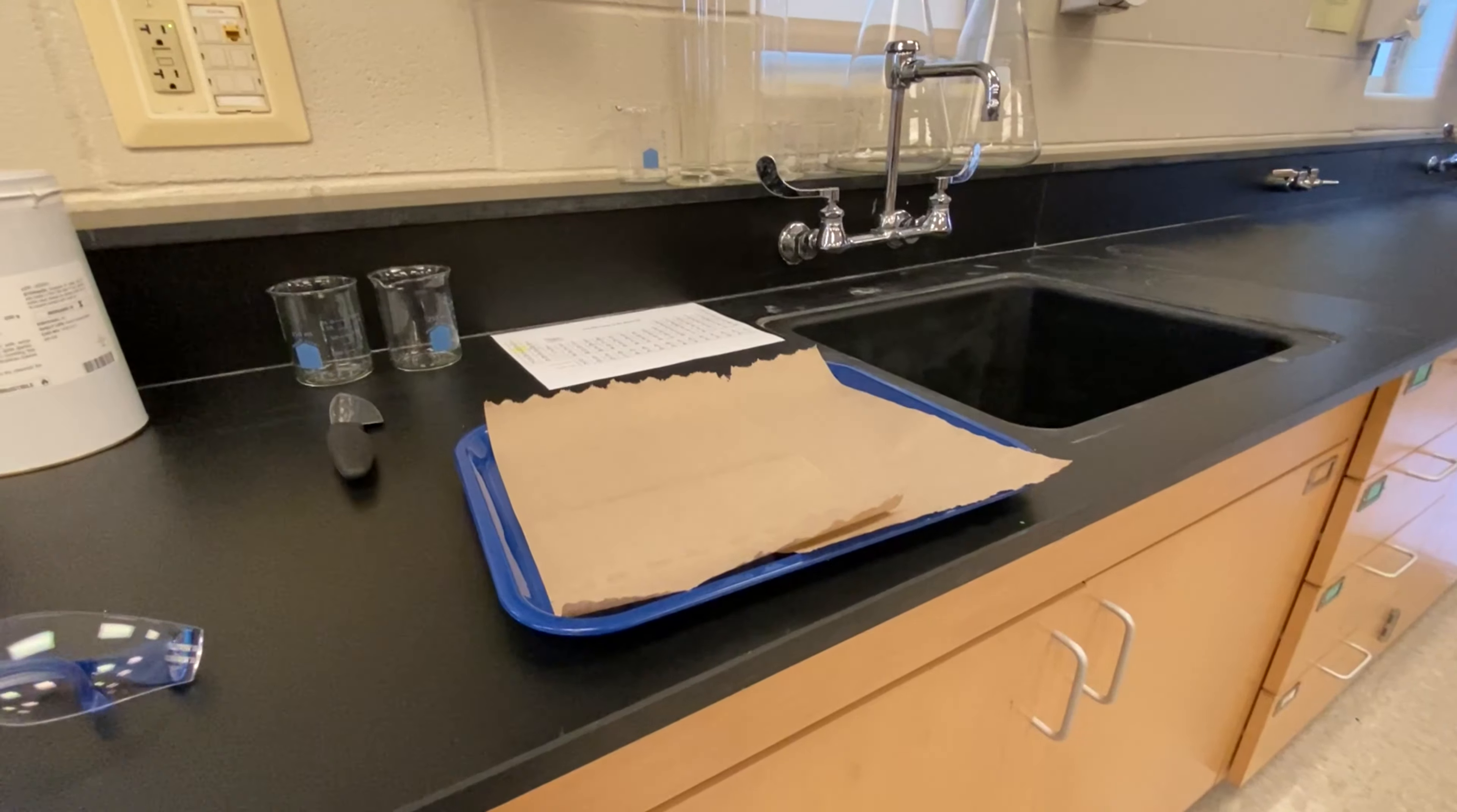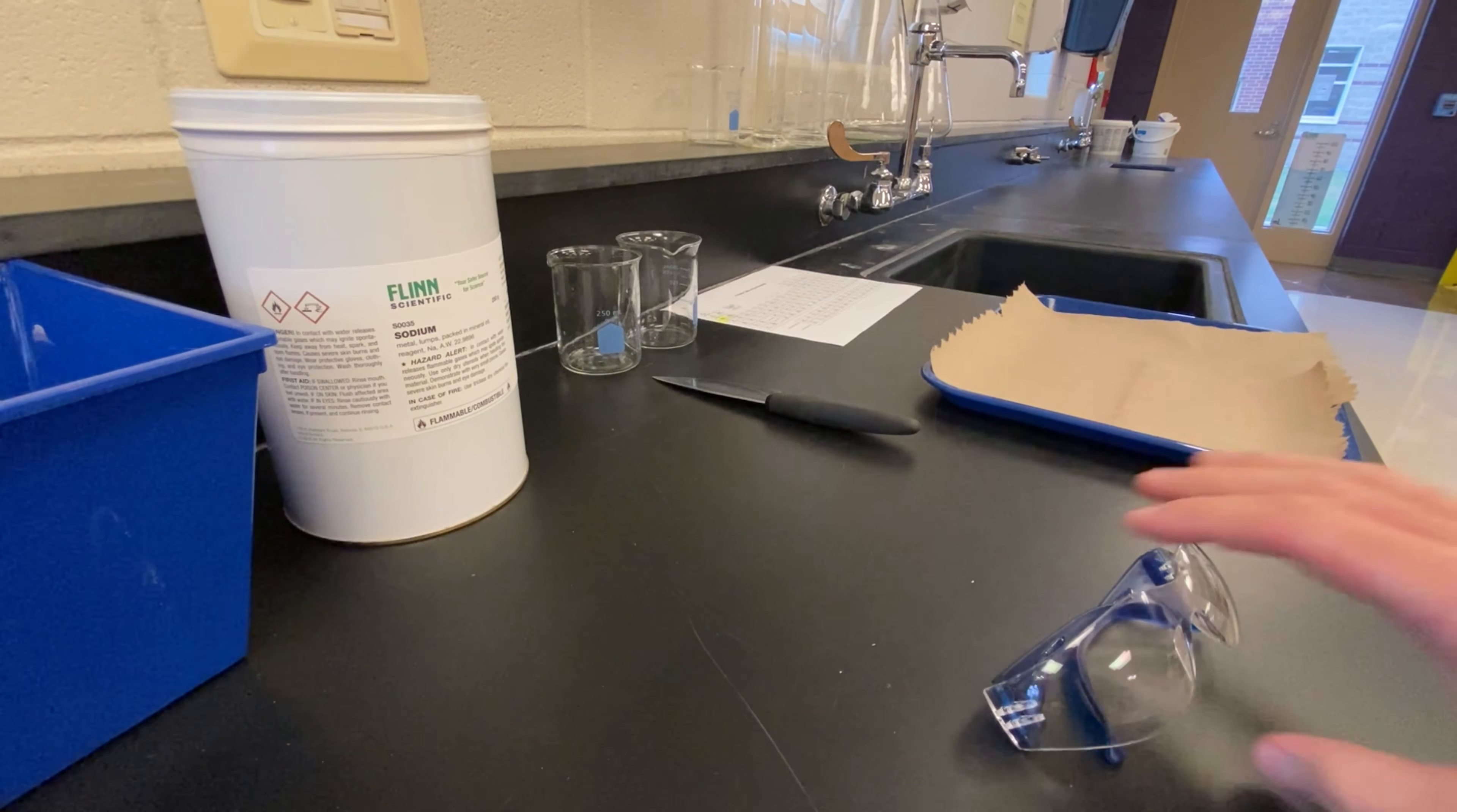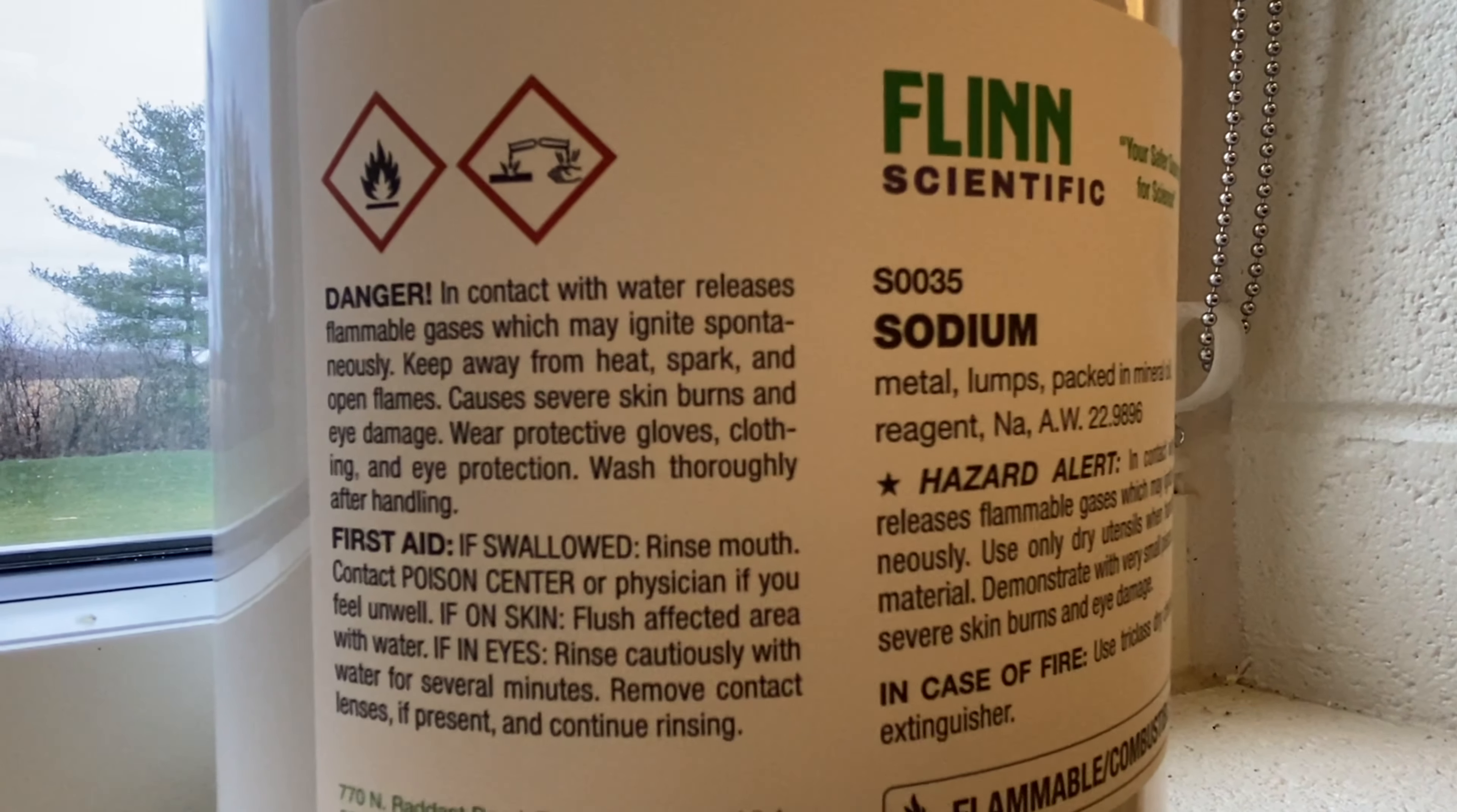We're going to be exploring the physical and chemical properties of this element on the periodic table. What your job is, is to take good observations, and we will use those observations to discuss this throughout a chemistry unit. Let's get started. As you can see here, I got a little setup of some materials that I'm going to be using in this lab today. And the first thing I'm going to want to do is make sure that I put on my goggles.